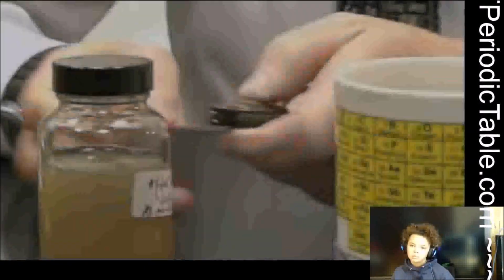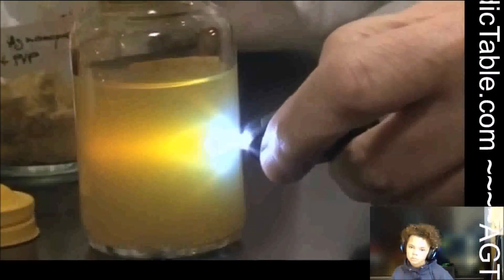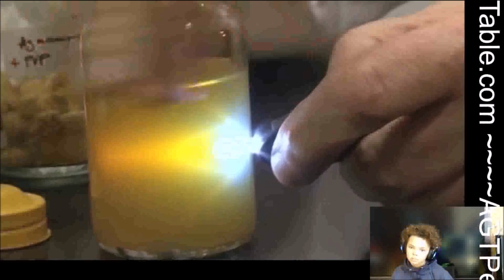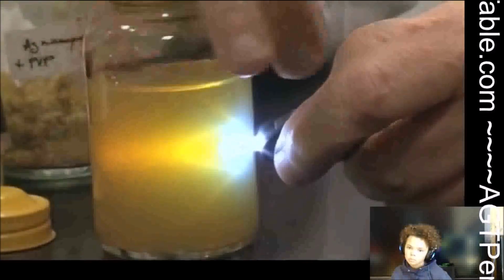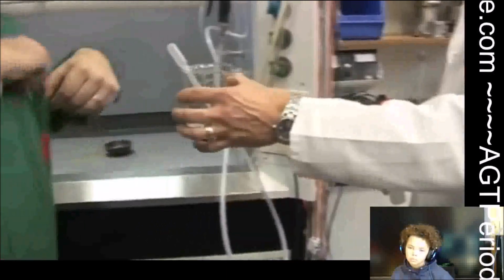And you can tell that it's got particles in it because if I can find a torch. So here we've got particles, and you can see the particles better if we shine light through it. And if you look at the light, you can see that there is a cone of light that looks rather like the headlights of a car in fog. And this is an effect that is called a Tyndall cone, which indicates that they're very, very tiny particles suspended in the solution. So this is not silver dissolved in the water, but actually very tiny particles.